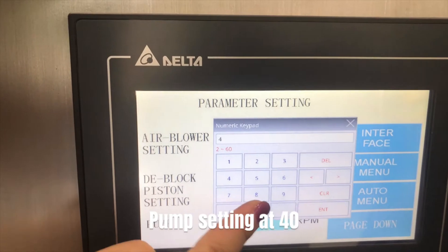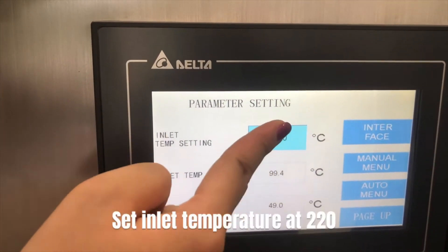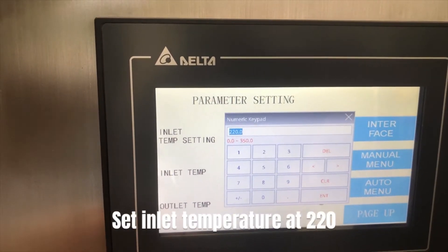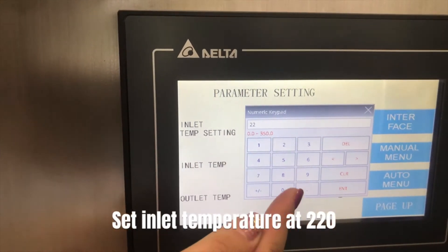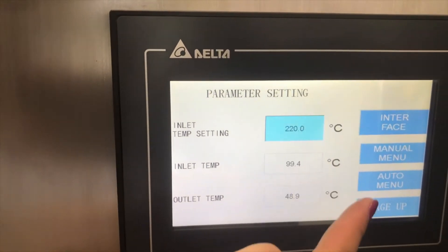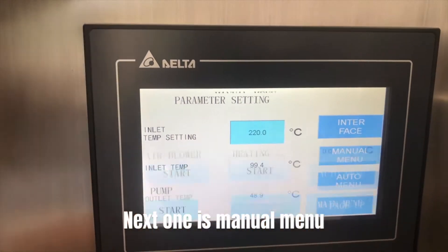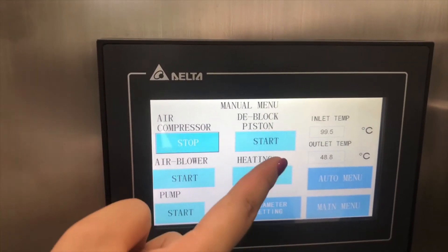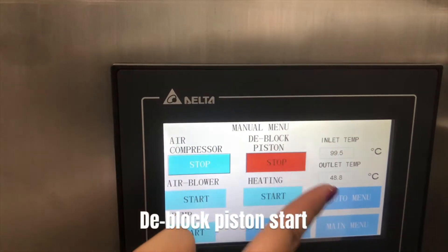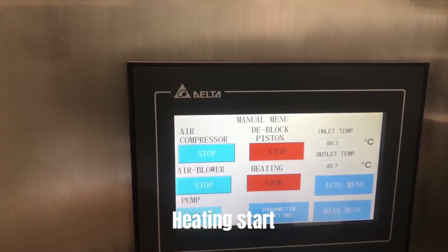Set the pump at 40, then scroll down. Set the inlet temperature at 220. Next, go to manual control: start the air compressor, start the deep block piston, start the air blower, and start heating.